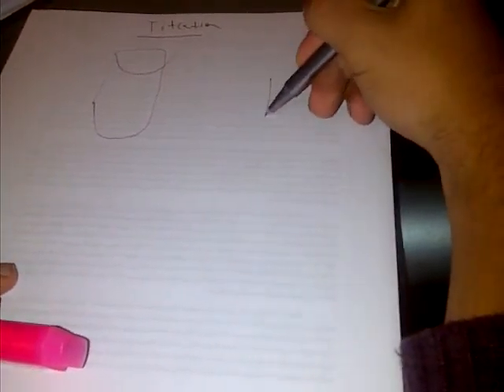Okay, so last but not least, I'd like to talk about titrations, and about the basic steps for titration. So let's say we need a standardized base. So here we have it. We need a graduated cylinder. So here would be our graduated cylinder. And we need a pH indicator, which would basically let us know our pH right there.